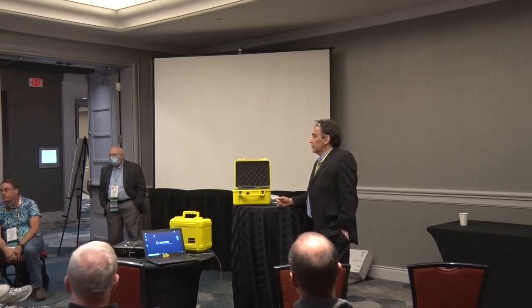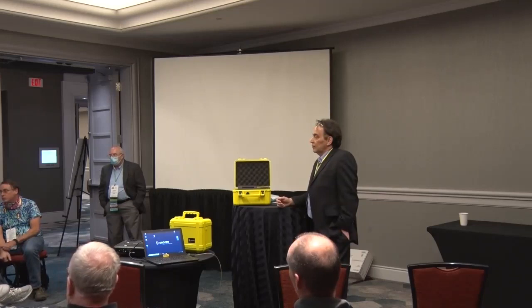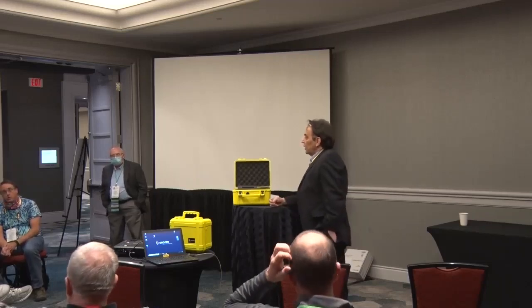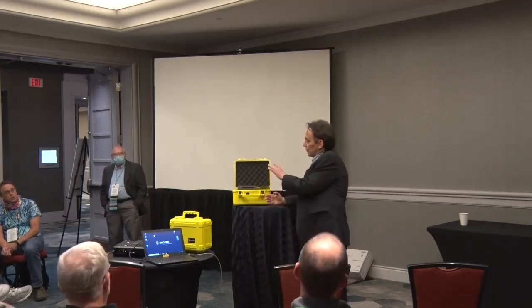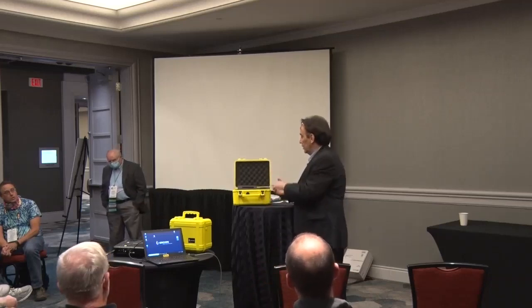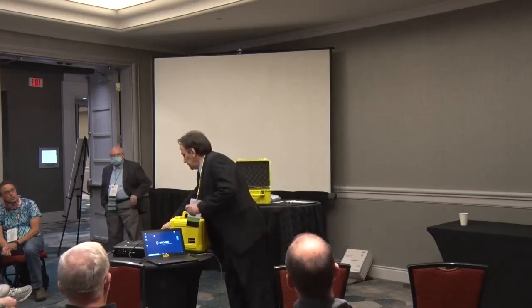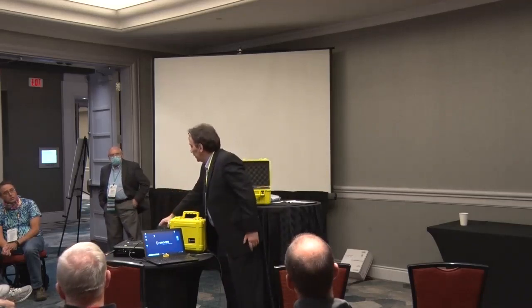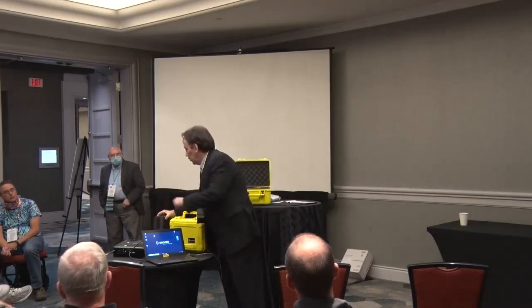No, the pump's pretty strong, and it pulls about half a liter per minute, I think, what I measured. 9 something inches. I'll try that again. Some of the early ones, we did have a problem making the seal of the cell to the body. So maybe it's from the leak. Or maybe it could be one of our early ones.